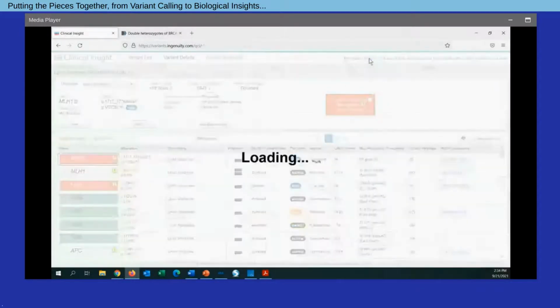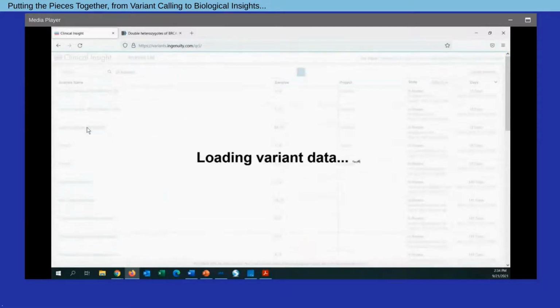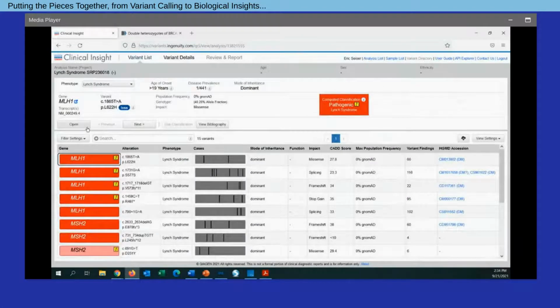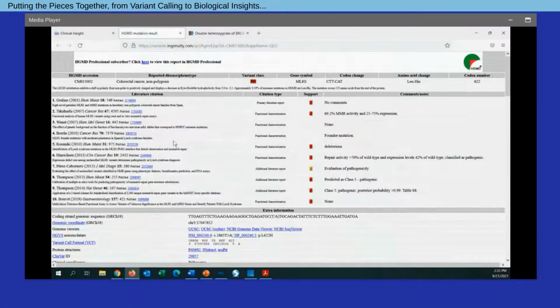I'm now going to switch my results over to those from the full cohort of 84 samples. And again, the results from this once loaded will look very similar. The key difference here with the table at the bottom is that for each variant, now we can mouse over these black bars and see which individual samples show that given variant of interest. And in addition to that, again, just like with the initial analysis, for any variant, I can open up the details, I can view the bibliography, I can link out, for instance, to HGMD, get the information there.